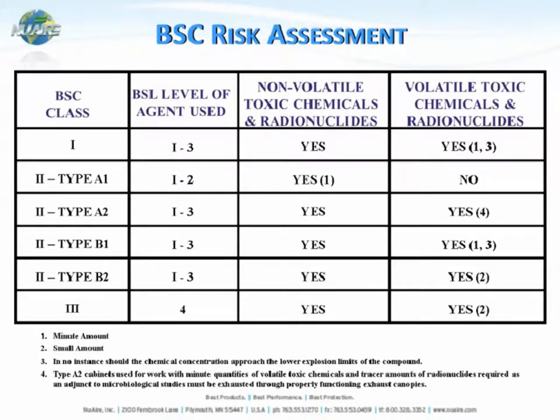For example, the Class II Type A1 is really used for BSL 1 or 2 agents and is only used for non-volatile toxic chemicals — it cannot be used for volatile toxic chemicals. For a Class II Type A2, you can use it for both non-volatile and volatile chemicals, but if you are using volatile toxic chemicals it must be exhausted to the outside and only in a minute quantity.